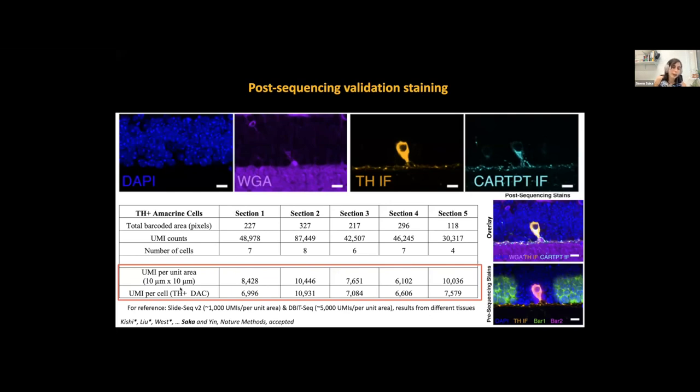And if you look at the cell size and calculate the transcripts per cell, it's again in the 6,000 to 10,000 range. So this many unique transcripts we're able to read. This is after removing contaminating species like ribosomal RNAs. These are the more informative transcripts.